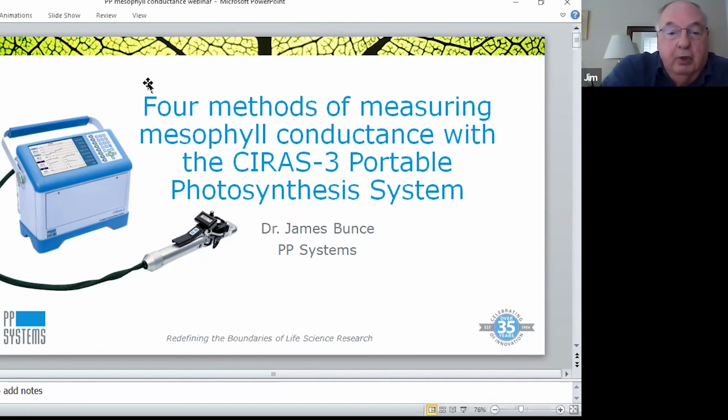You would expect that any stress is going to affect the shape of an ACI curve, and it may or may not affect mesophyll conductance. If I've misunderstood that question, just rephrase it and I'll try again. I'm sure we can follow up afterwards, Jim, and try to get some clarification.